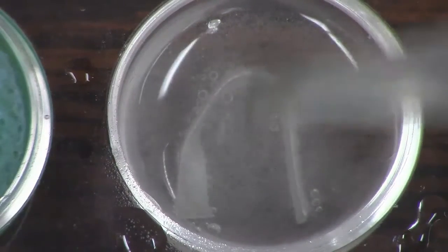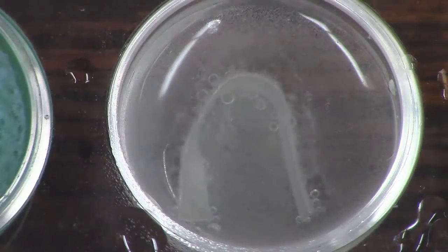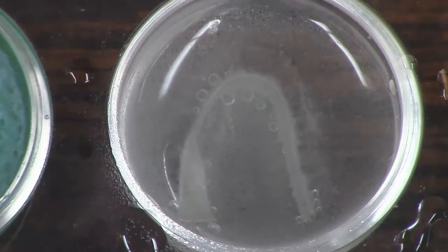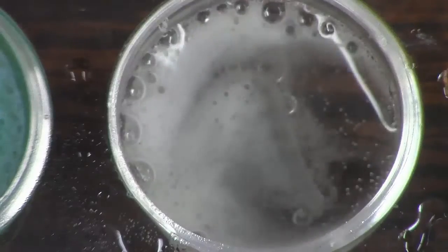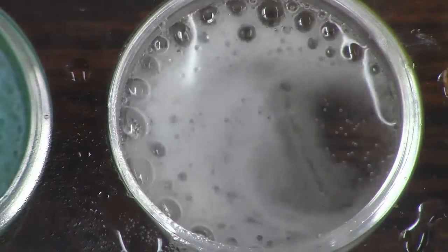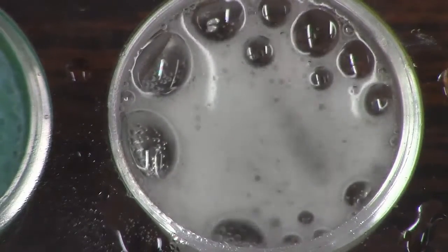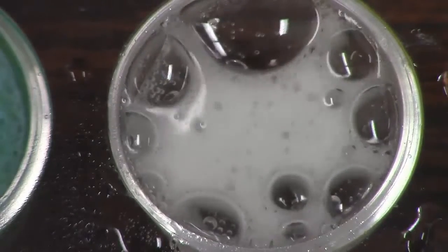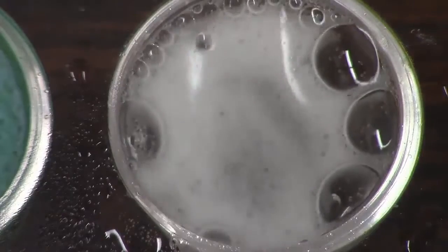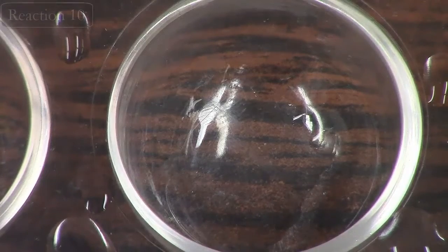So record what you observe happening, and then based on that observation, make a prediction about what products might have been formed. This is also a reaction that if we were doing it live, you would probably see it go for a few minutes actually. So we'll move on to our final reaction in this lab.